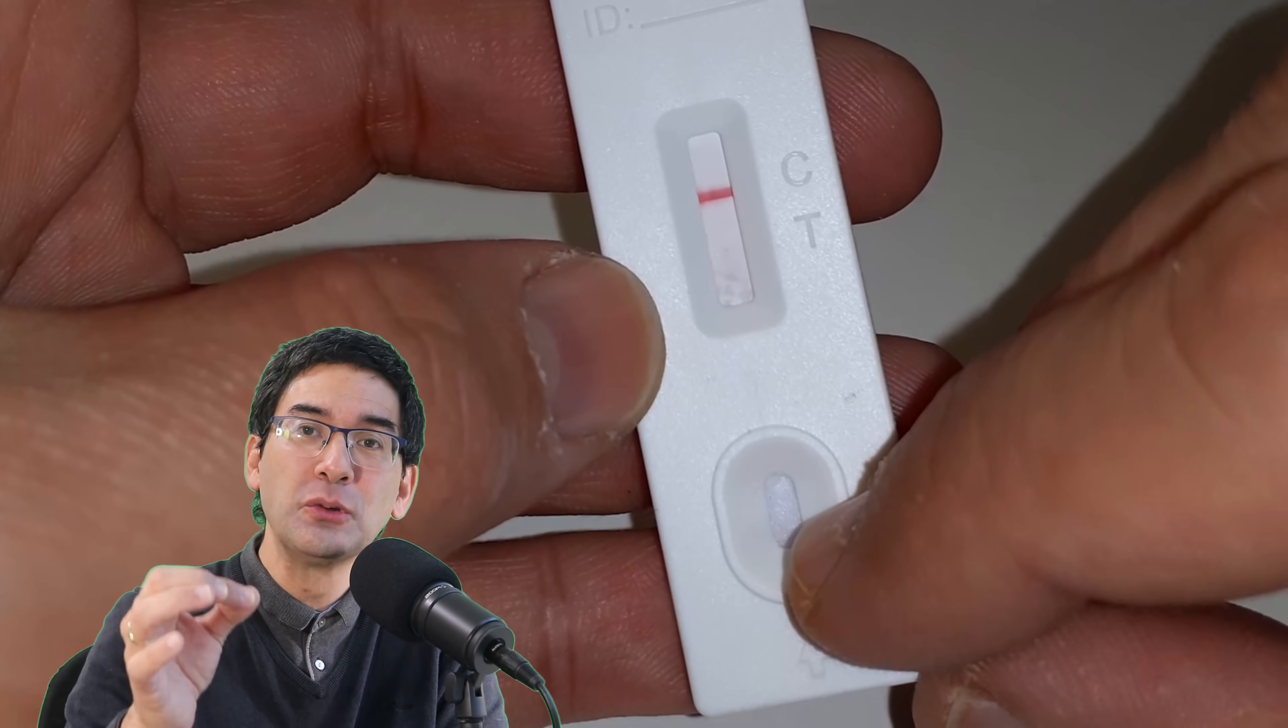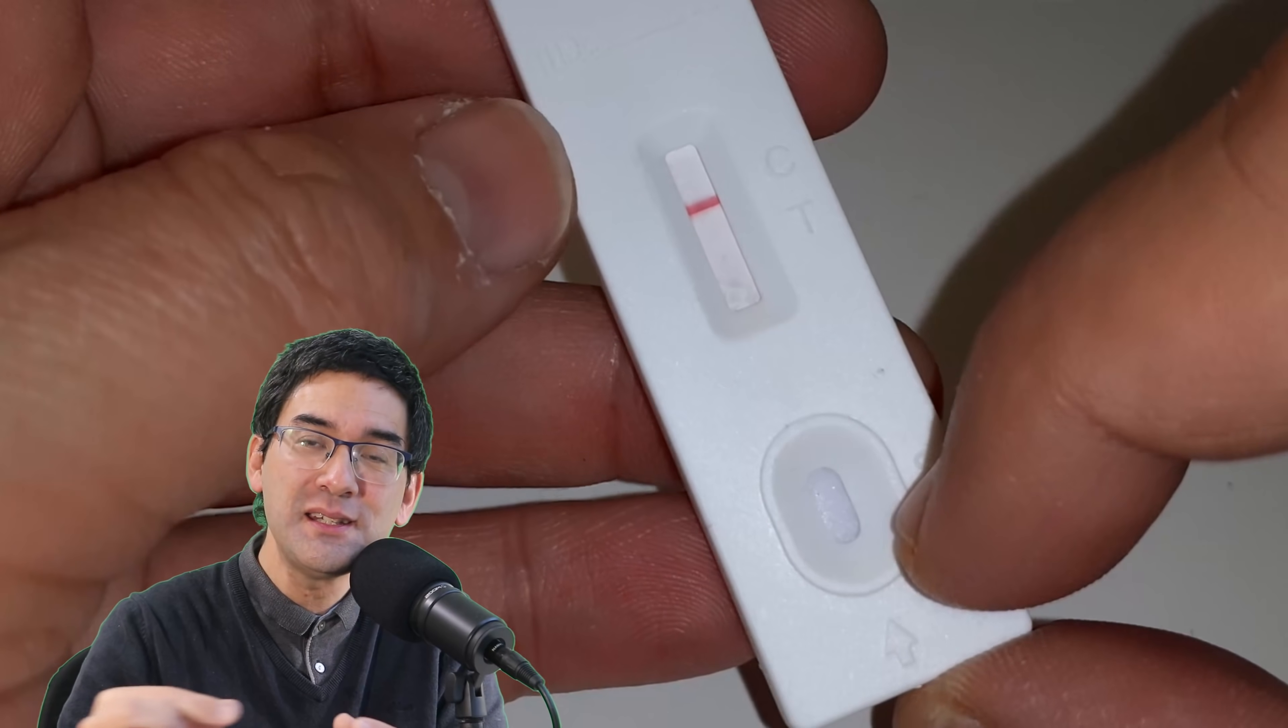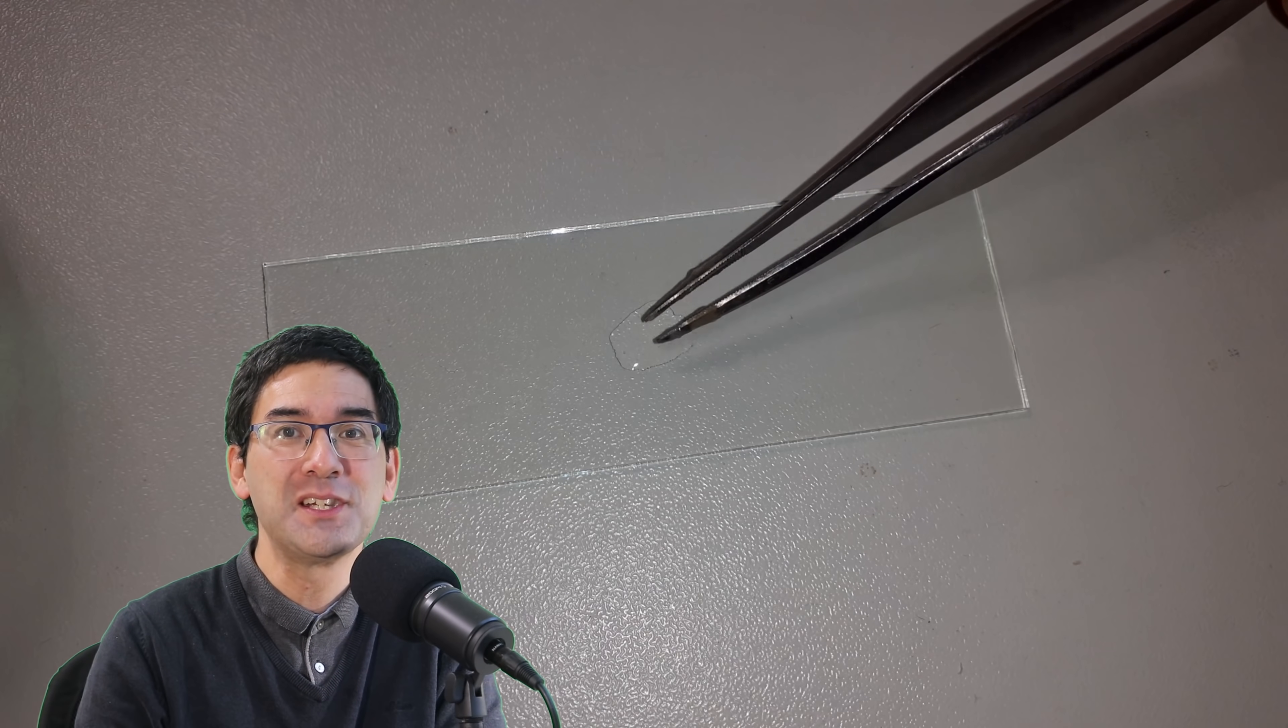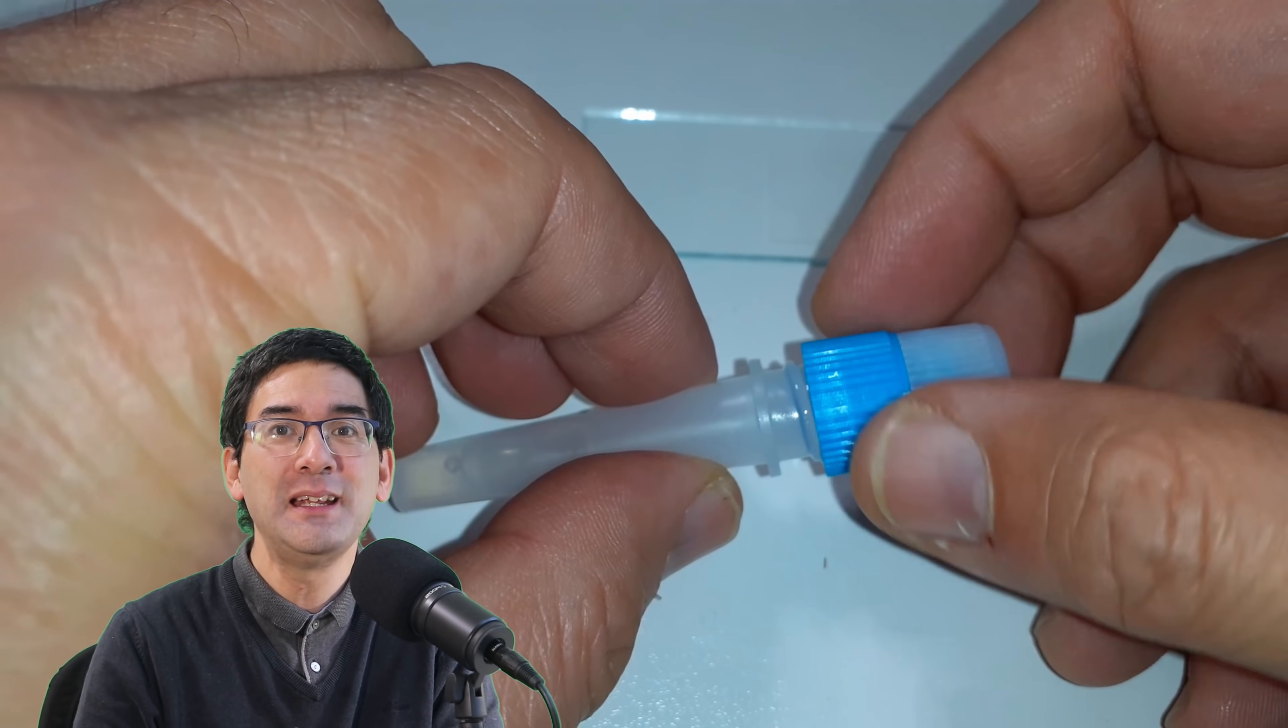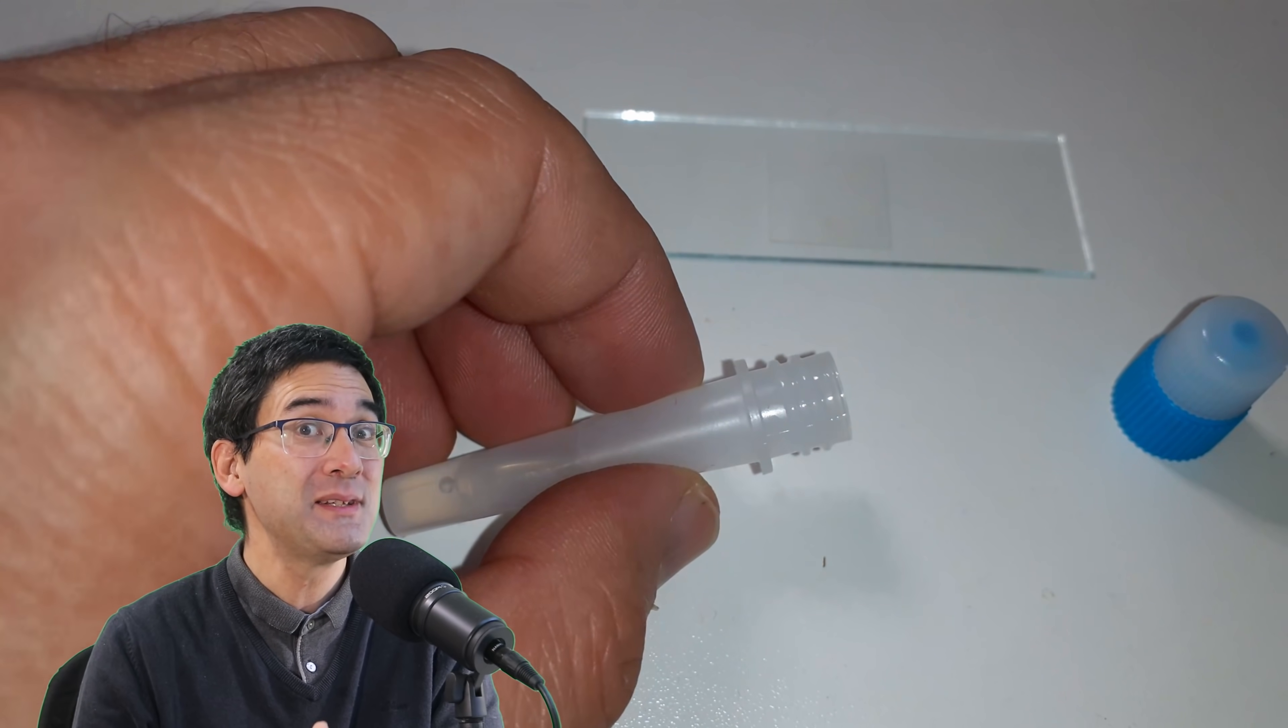When you put the solution on the test strip, the corona test strip, then you have an antigen reaction if the virus is present. What I've done is taken some of the solution and mixed it with a water sample containing water microorganisms, and I wanted to see what actually happens.